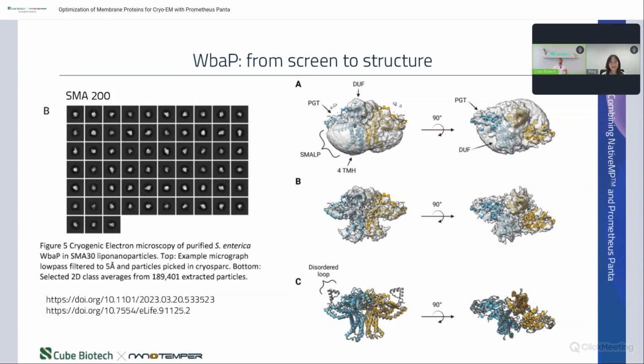That's amazing. We have rarely seen something like this, that from such a small sample, you can see it's also possible to have a major success, especially now for those monotopic phosphoglycosyl transferases, out of the screening purification. So no upscale, nothing, just like this. He was very lucky from this, but you can see that this is possible.